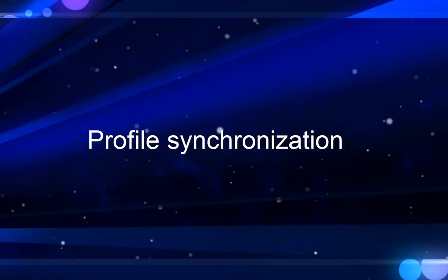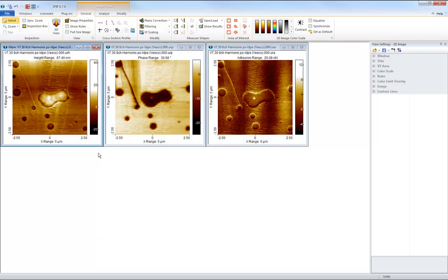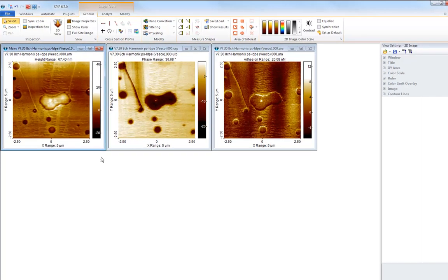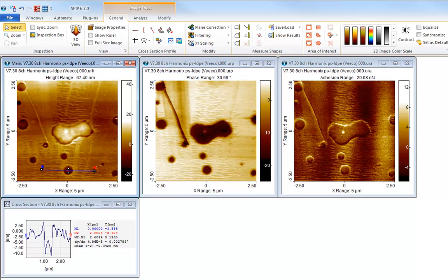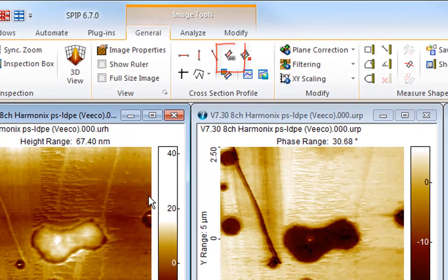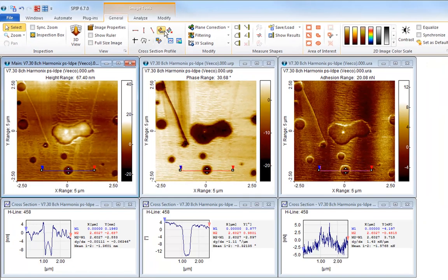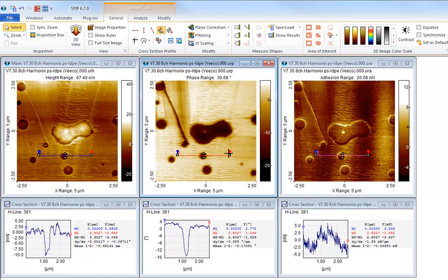With multi-channel images, it is essential to be able to analyze the exact same cross-section from the different images. To help doing this, SPIP has the Profiles Synchronize feature. In this example, three channels of an eight-channel recording have been opened. We first draw a cross-section profile in any of the three images. Then we click the Synchronize button, and profiles appear in the other images at the exact same positions. We can now move the profiles around while the three images will stay synchronized.